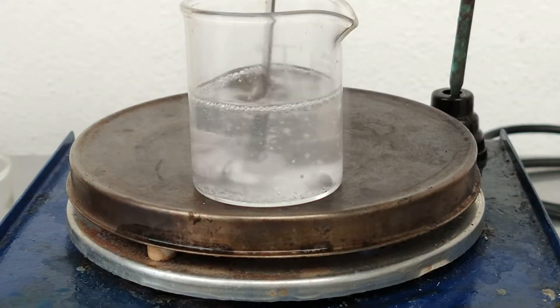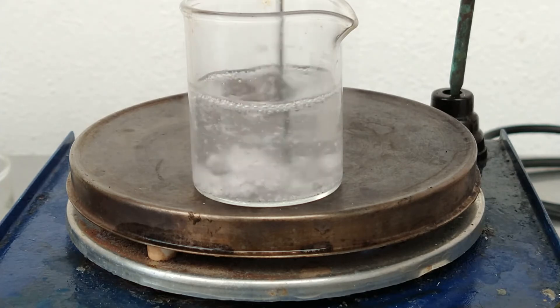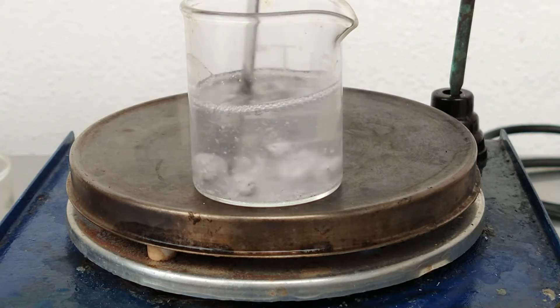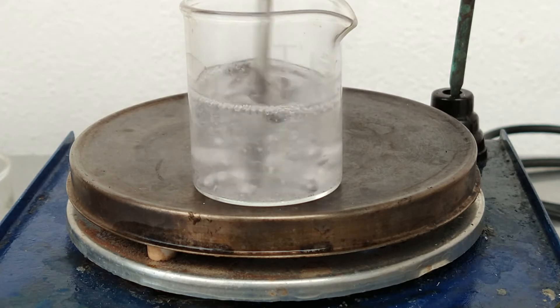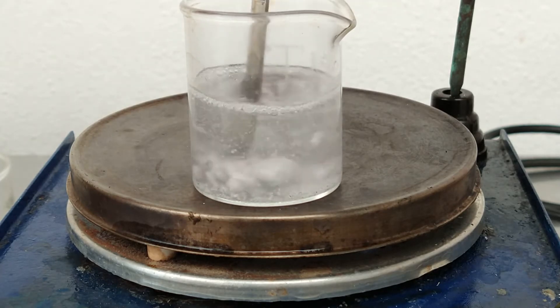We have here our beaker with the melted sodium on the hot plate and the sodium has already started to melt, forming kind of spheres at the bottom of the beaker.